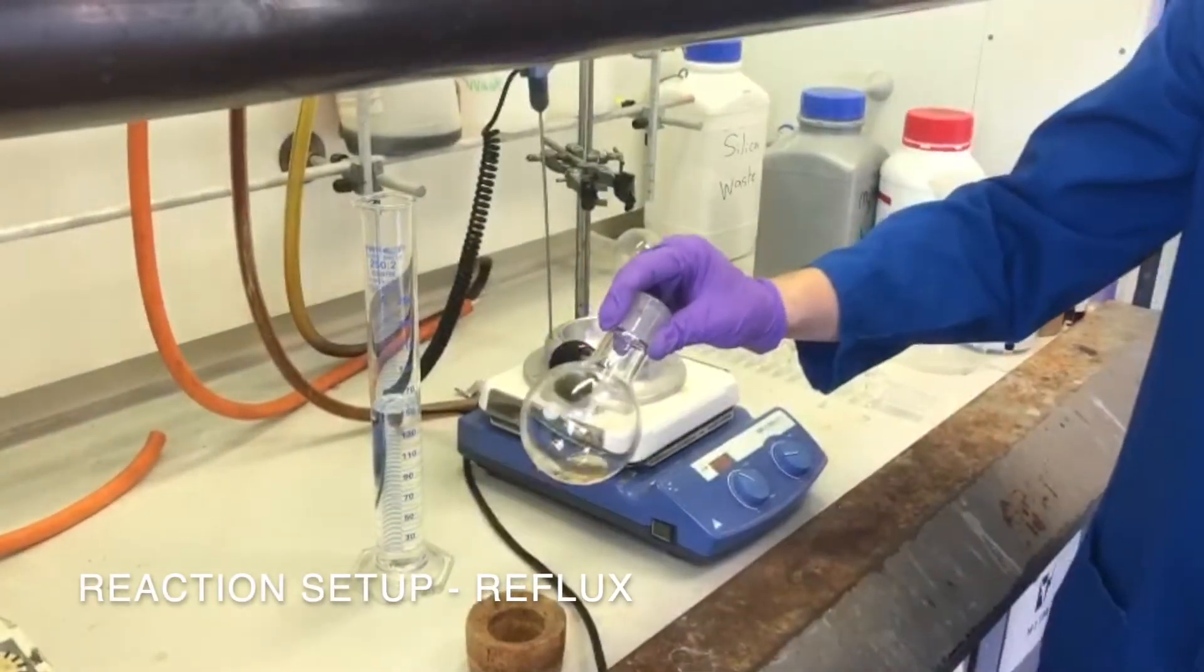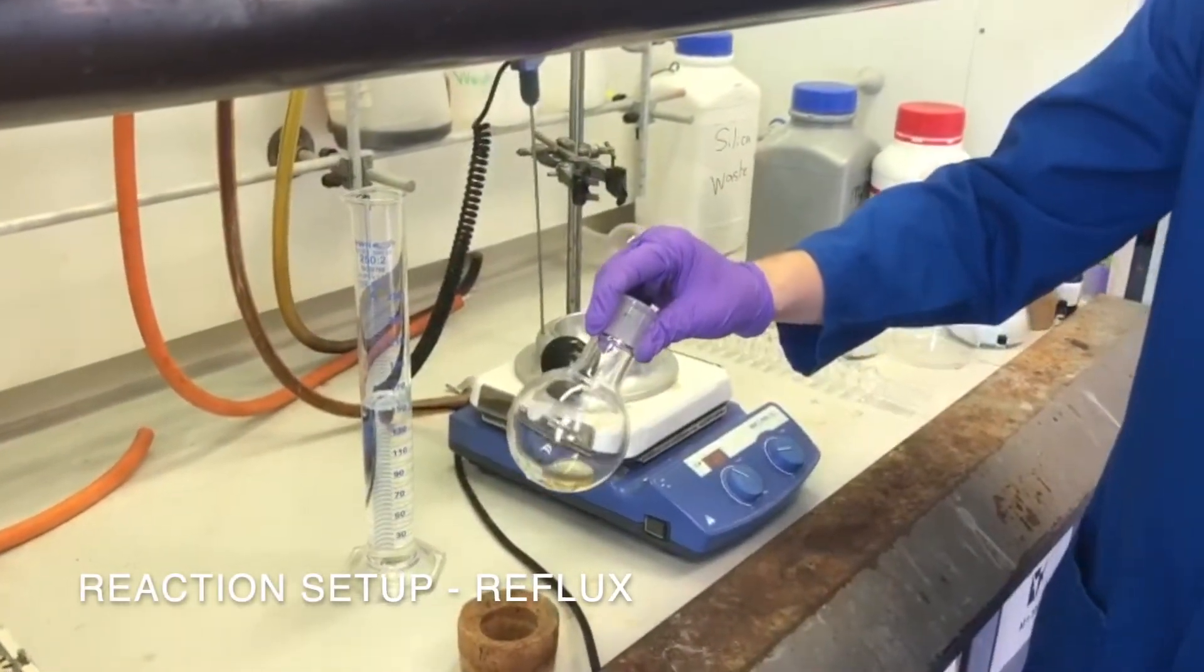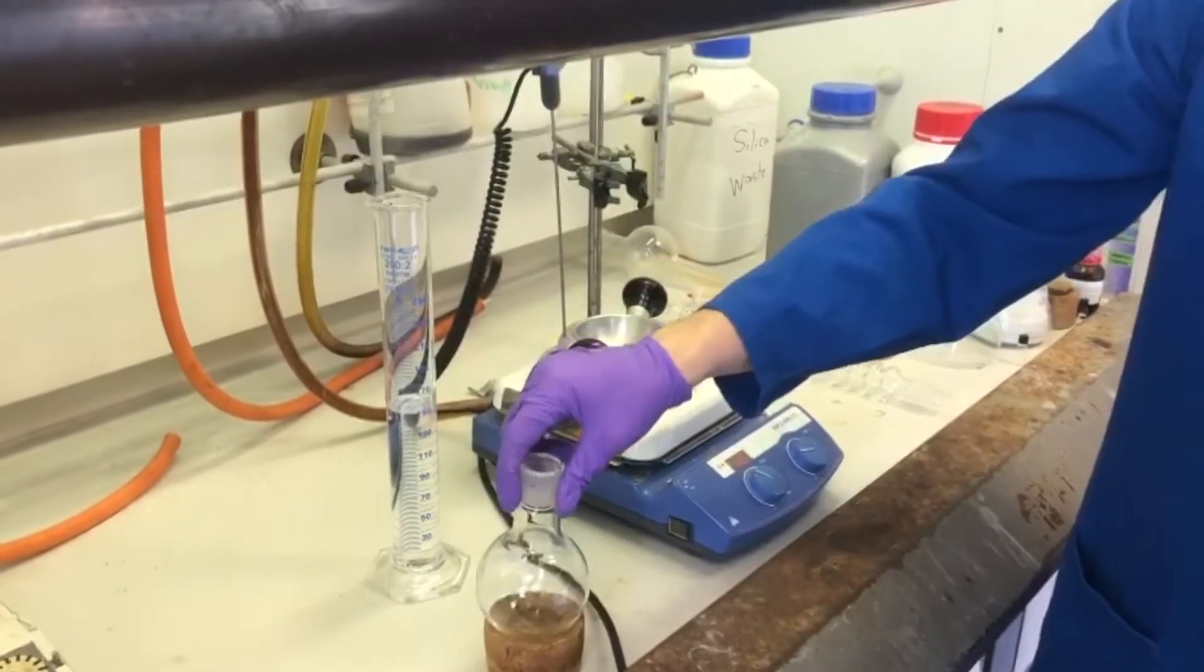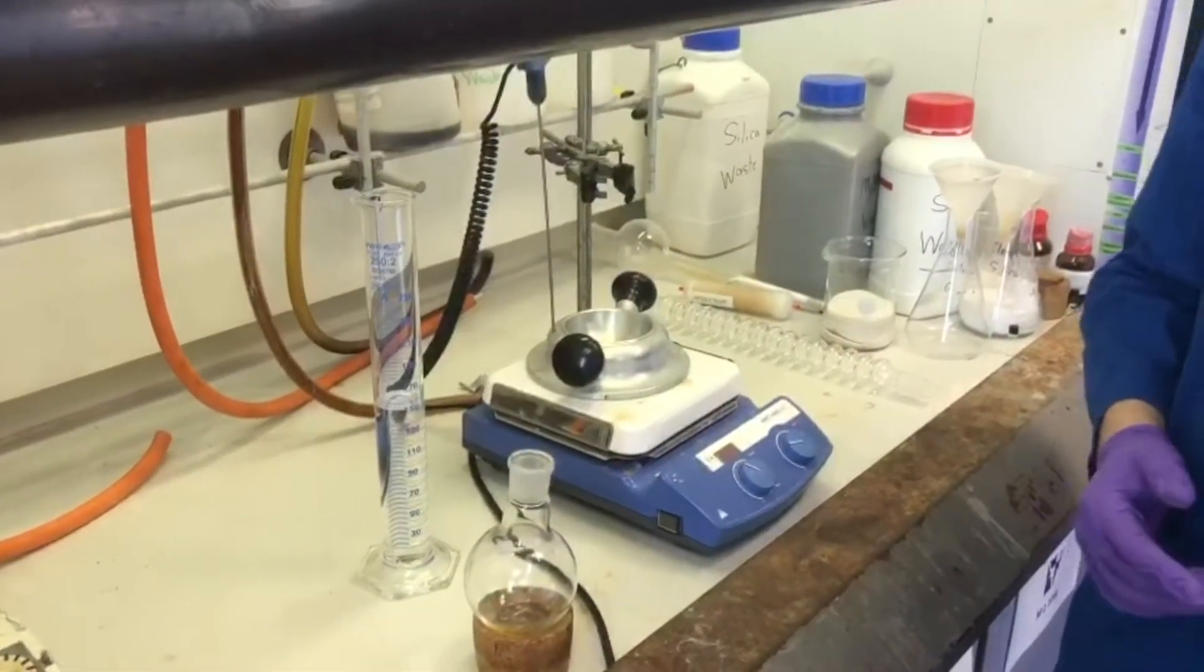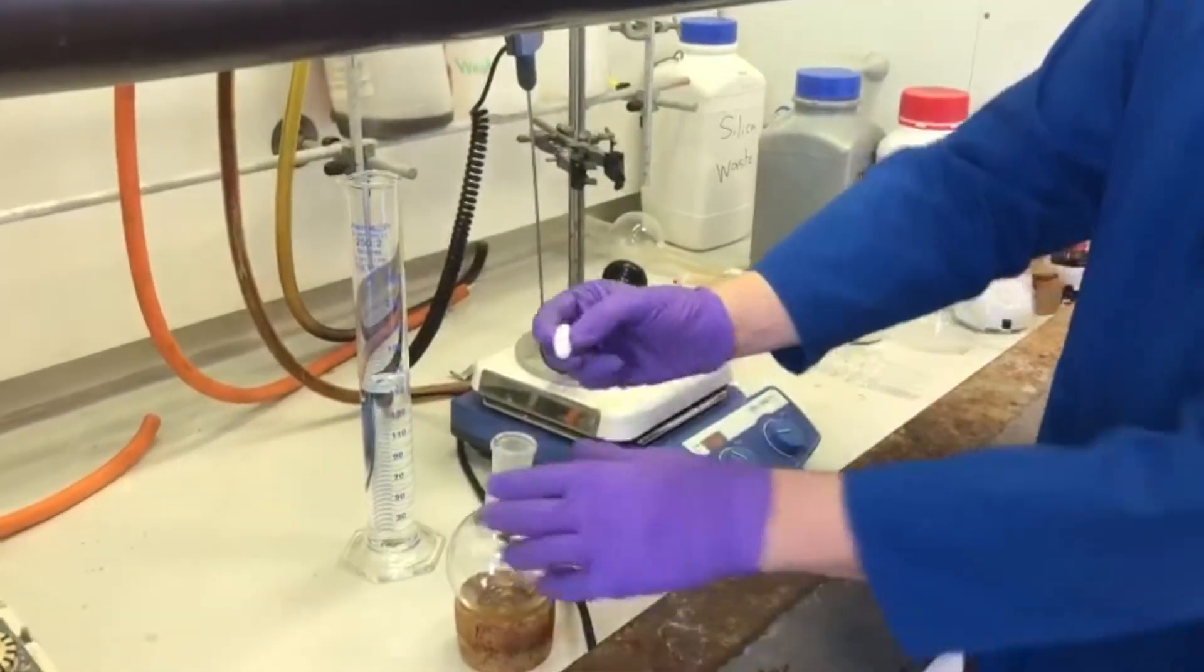As you can see we've removed the formic acid from our product, which has given us a pale yellow oil. This might be a gunky solid, and that's entirely normal, it's substrate dependent. So add a stir bar back in.